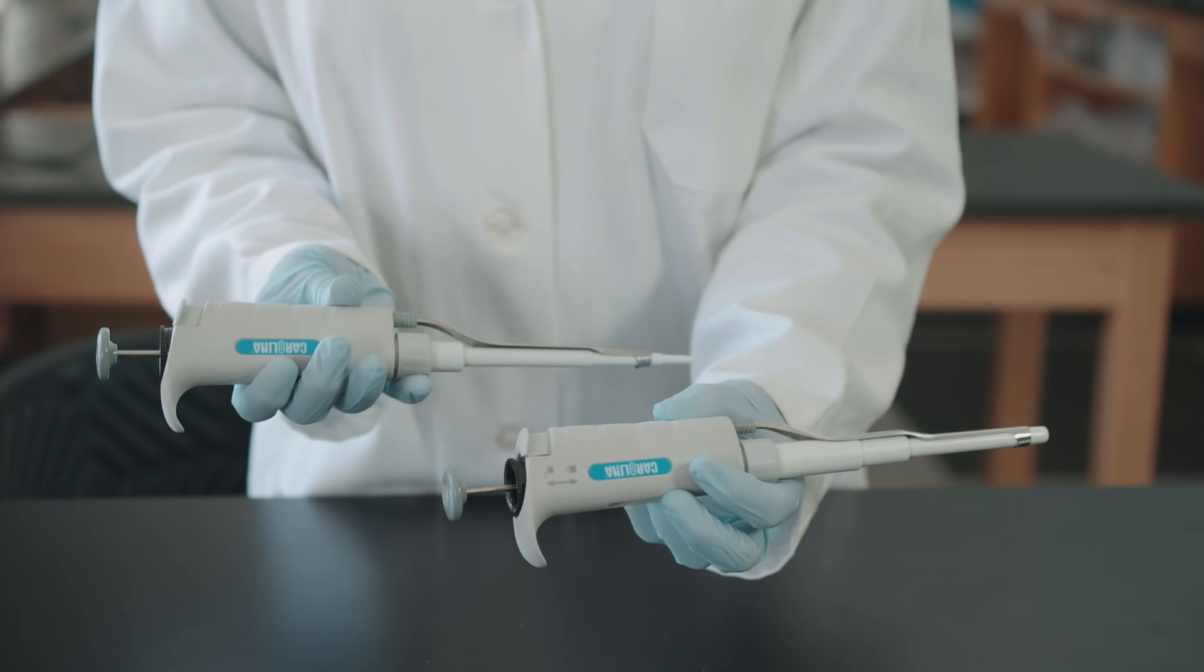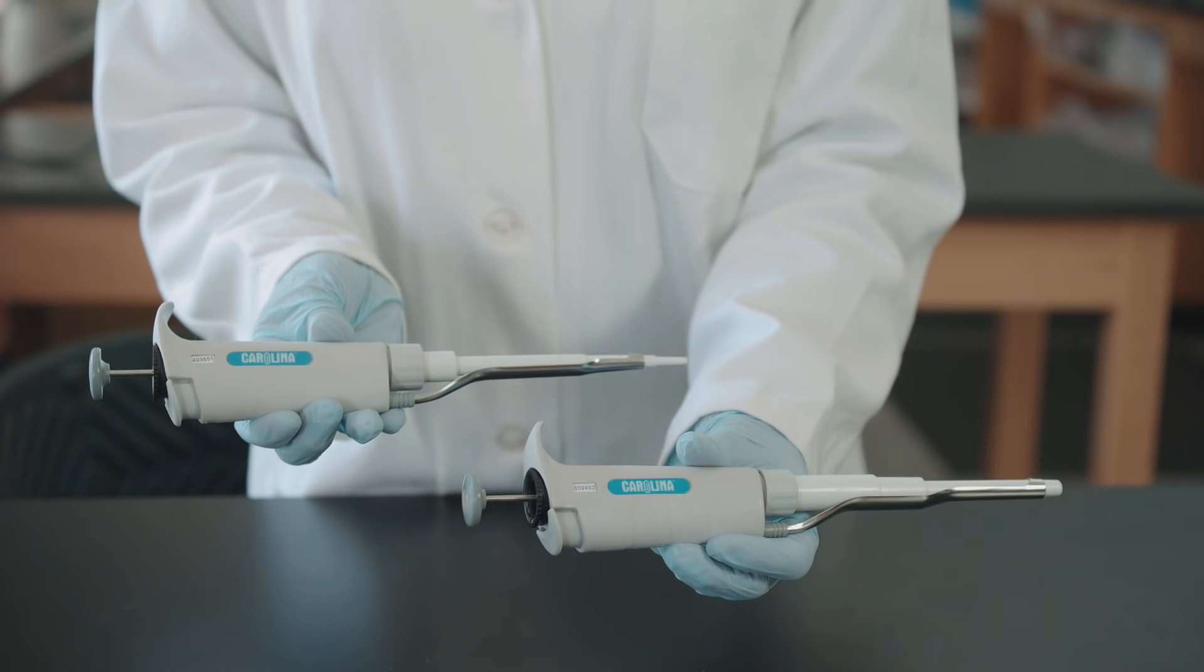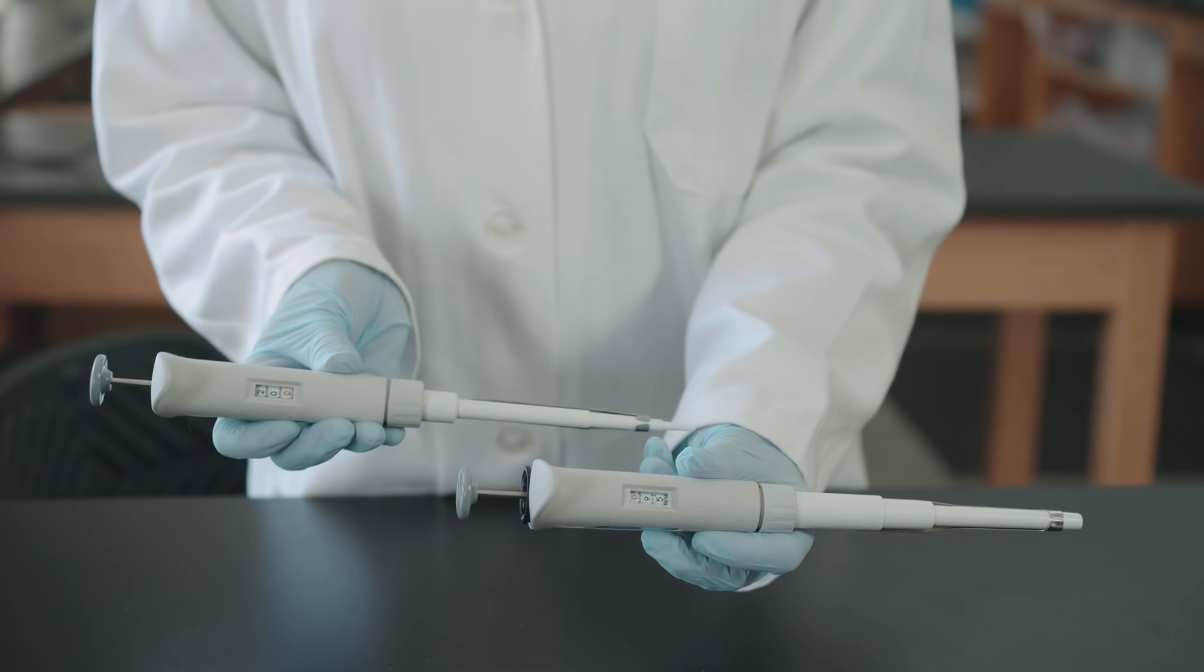Micro pipettes are used to measure small volumes, usually volumes smaller than a milliliter. There are different types of micro pipettes for measuring different ranges in volume.